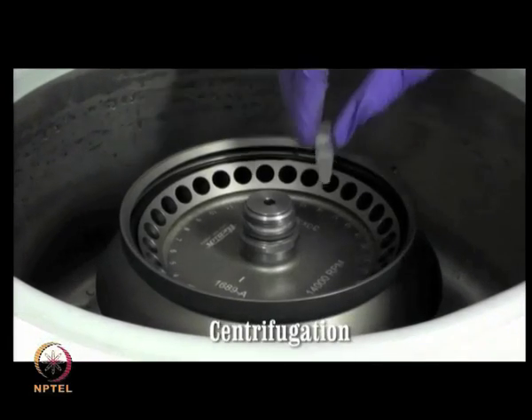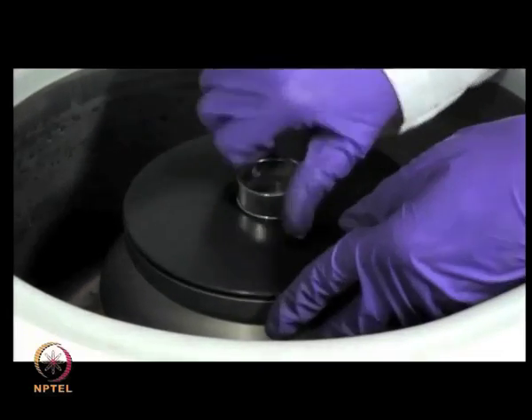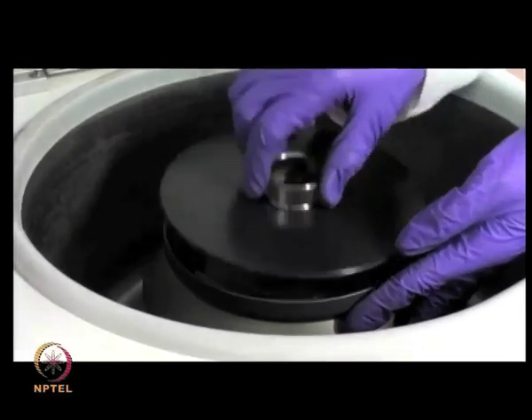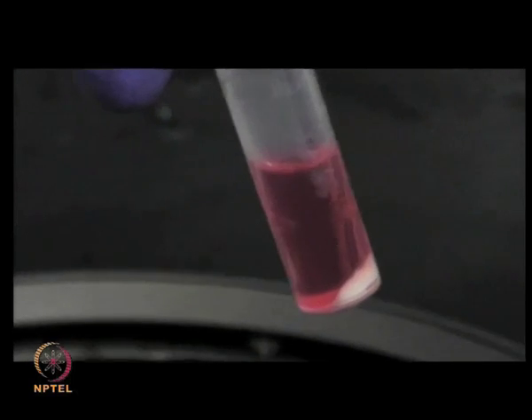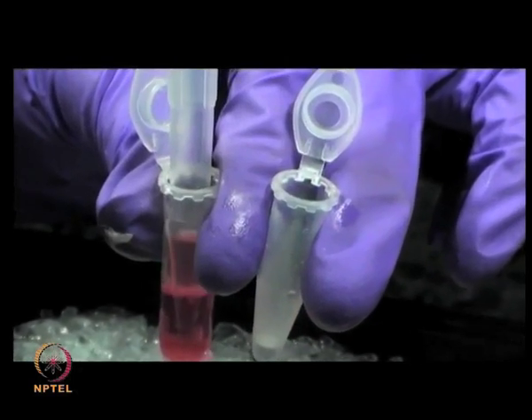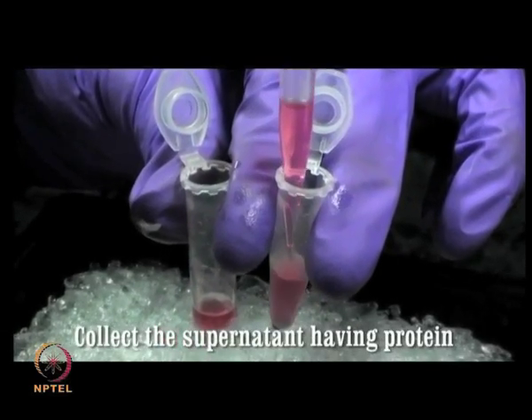Centrifuge the contents at 2000 rpm for 5 minutes. The DNA forms a white precipitate at the bottom of the tube while the proteins remain in the clear supernatant. Collect the supernatant in a fresh tube.